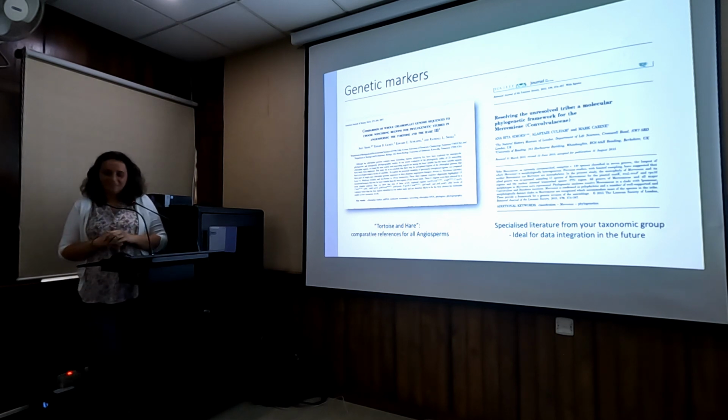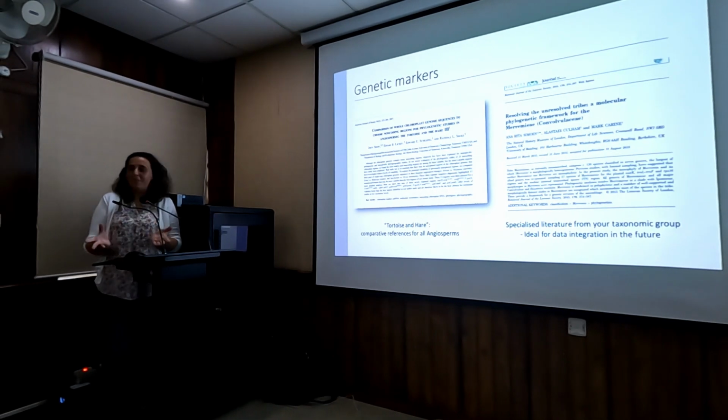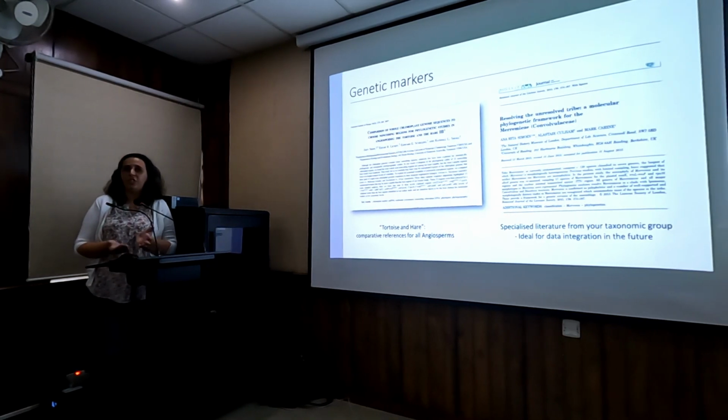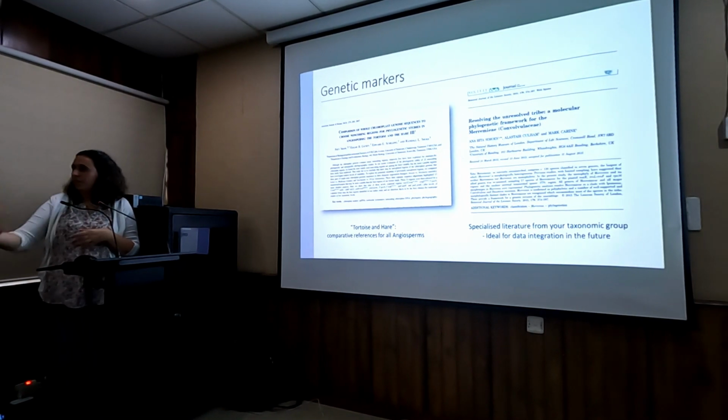So I sound old school in that, but I do think that if you've got a pen and paper to write, then you should use a pen and paper to write. So if Sanger sequencing and a couple of chloroplast and nuclear markers are helping you with your research question, there's no reason for you to go to another step and generate lots of genomic data, and get into lots of trouble, if that data is giving you what you need.